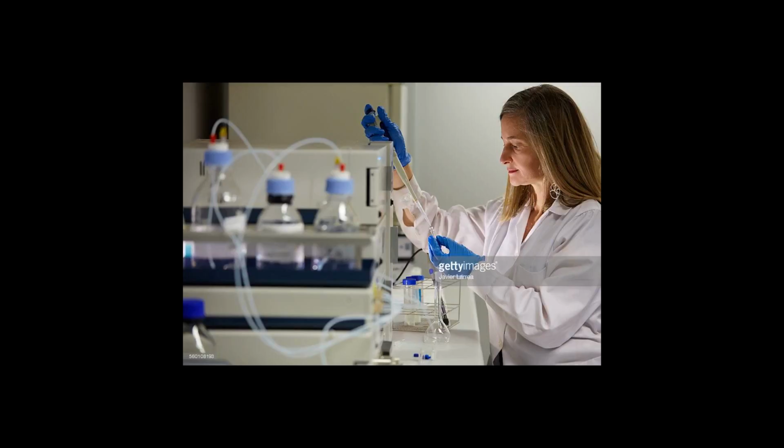elute more readily. Early in the analysis, an investigator can increase retention times by adding more water to the mobile phase, thereby making the affinity of the hydrophobic analyte for the hydrophobic stationary phase stronger relative to the now more hydrophilic mobile phase. Similarly, an investigator can decrease retention time by adding more organic solvent to the eluent.